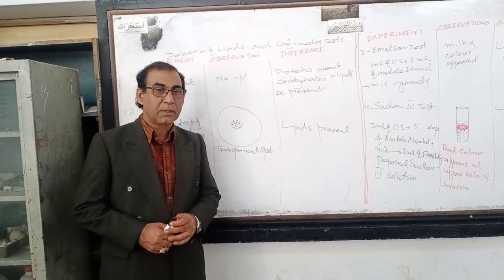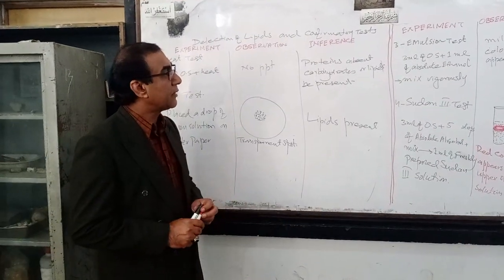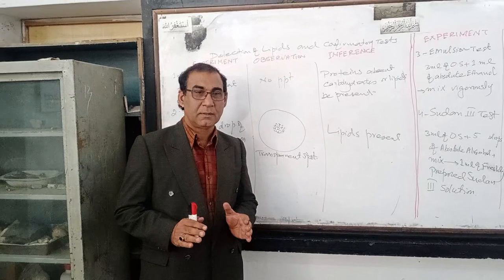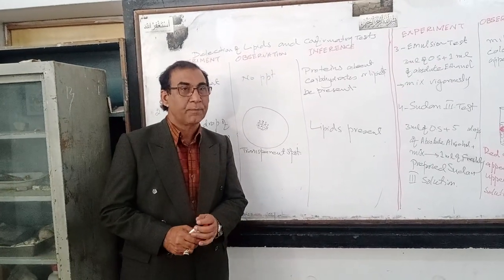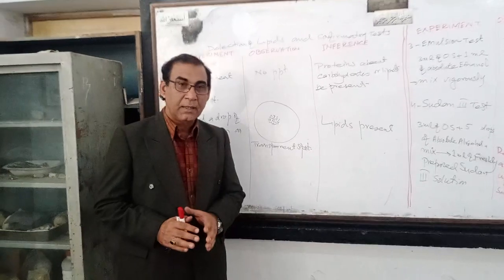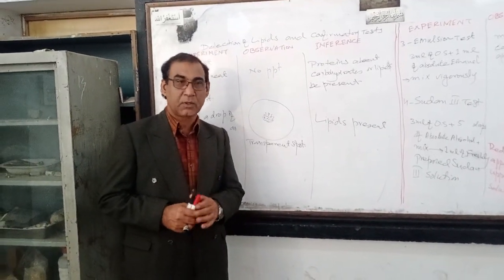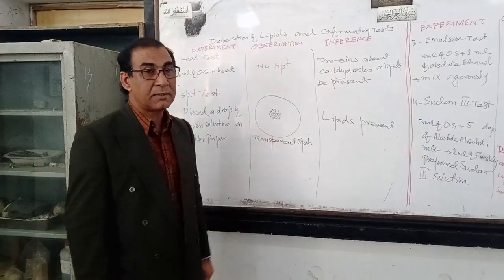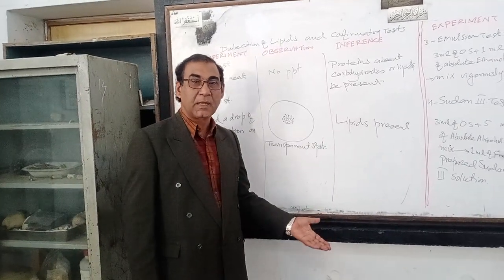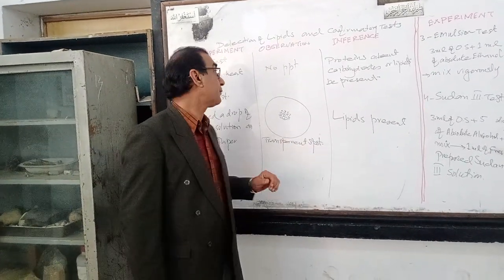Bismillahirrahmanirrahim. Today we are going to perform the test for the detection of lipids and their confirmatory test. Usually the students of FSC and BS third semester come across this test in their examination because it is included in their syllabus, FSC syllabus as well as the BS syllabus.